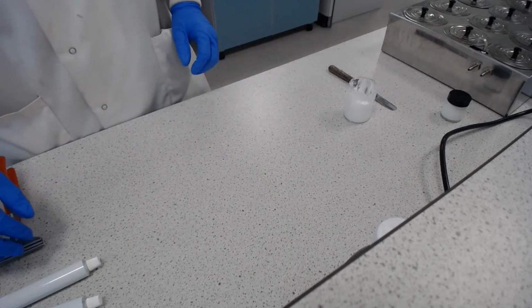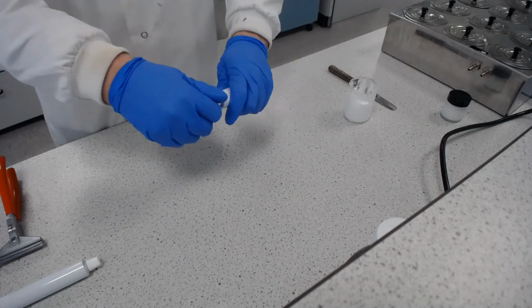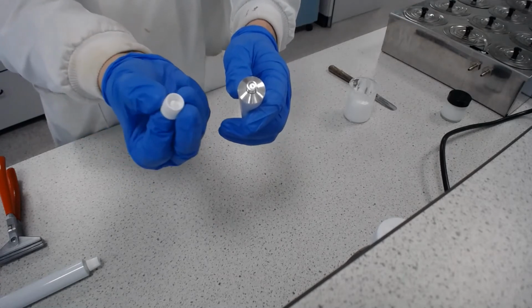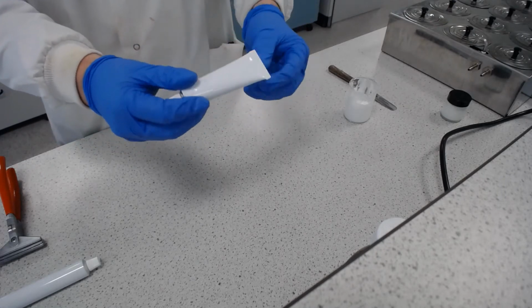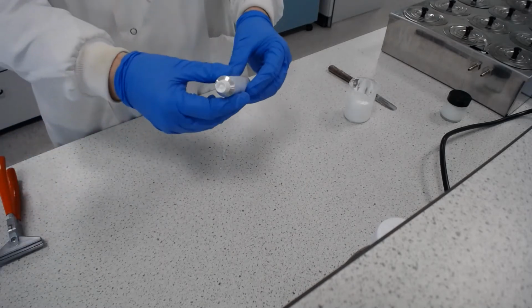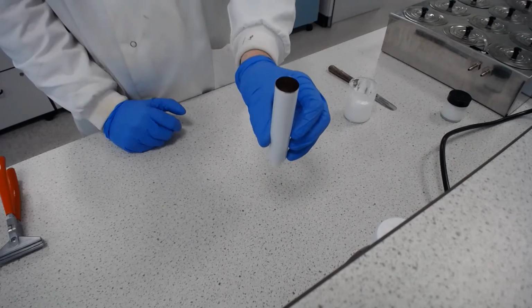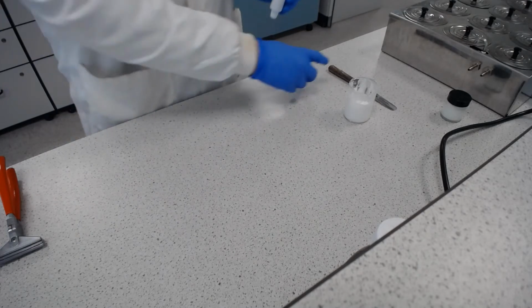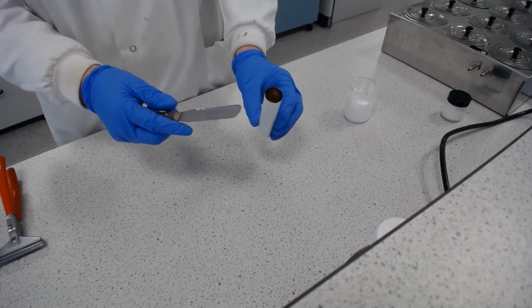The other thing that we might want to do is we might want to make one of these tubes. So this one's empty, but you can see that they're sealed on the top, and when you use them, you use the back of the lid to pierce that so you can get your cream out. So there's no real way of getting our cream into there, except that one is the finished version of this. So these come with their backs open like that, and then we need to get our cream down into there, which, as you can imagine, with a palette knife and a semi-solid mixture, can be a bit of a challenge.